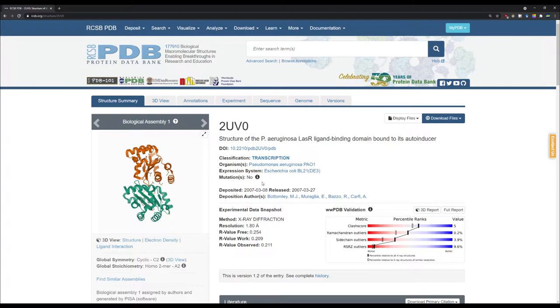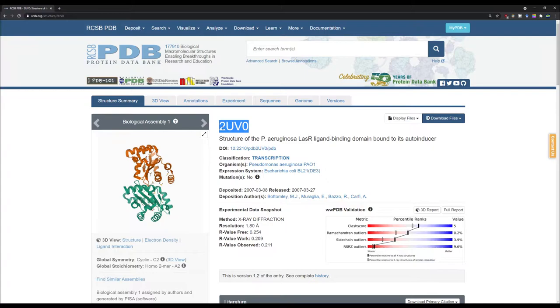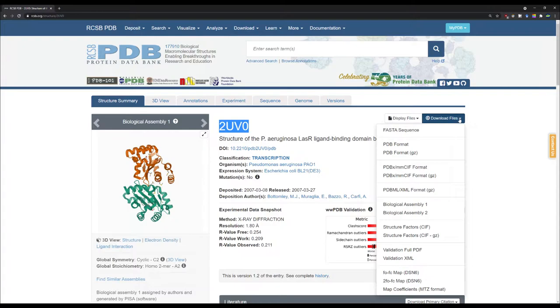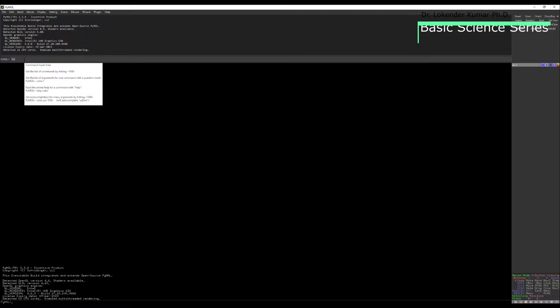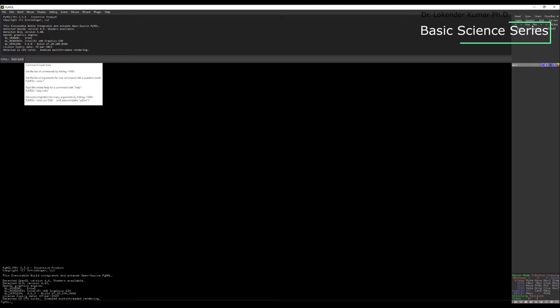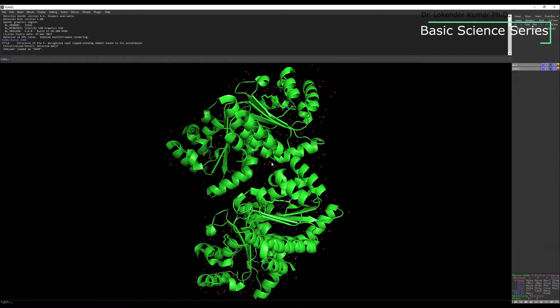The next thing we need to do is note down this particular PDB ID. You can directly download from here, or you can use PyMOL software. I'm going to use PyMOL to import the structure using the fetch command. You type F-E-T-C-H and then the code, press enter, and the structure will get imported into PyMOL.